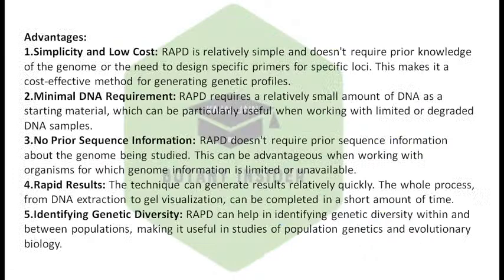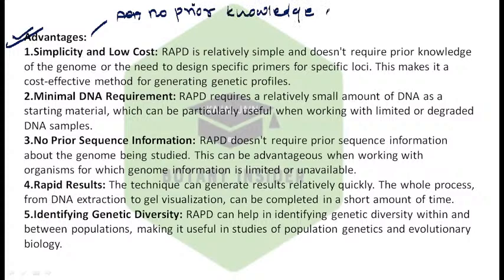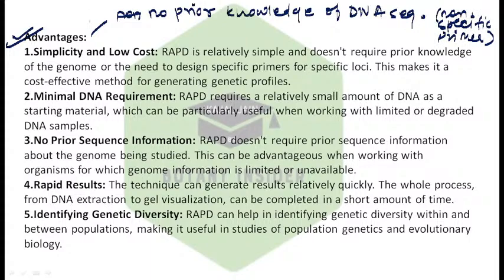Now, what are the advantages or disadvantages of using this technique? The first and major advantage of using this technique is that it does not require prior knowledge of the DNA sequence because we are using non-specific primers. And it can amplify even the smallest amount of DNA.